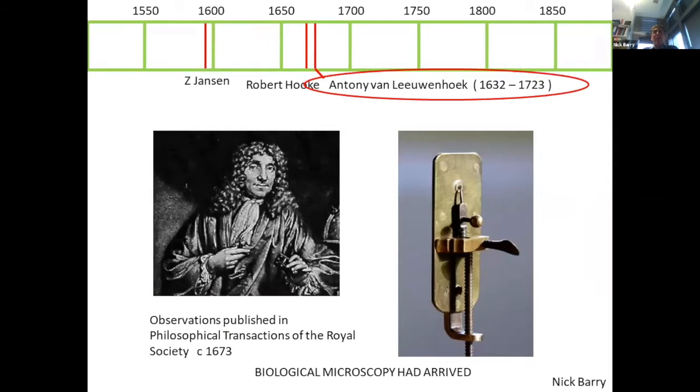The other big figure, of course, is Leeuwenhoek, who published his works a little bit later, but basically these were contemporaries. Here's a picture of his actual microscope. You can see this little black dot is actually a simple lens. It's a very short, nearly spherical lens mounted in this brass plate. The sample was stuck on this spike, and then the rest of this mechanism is all about moving it around and focusing it. You just looked through from the backside with sunlight coming in behind the specimen on that spike.